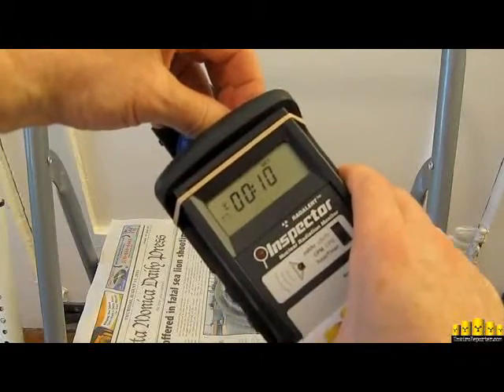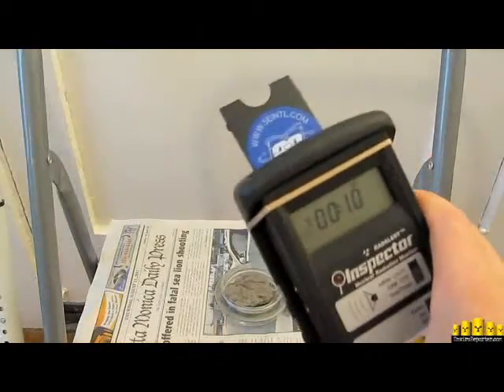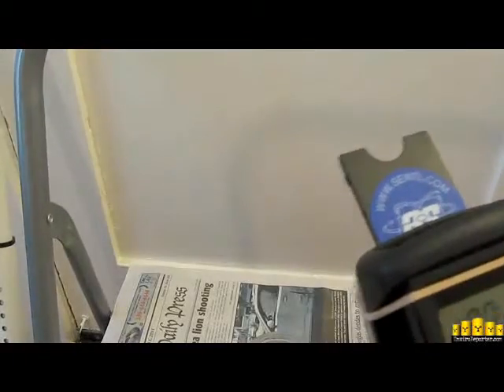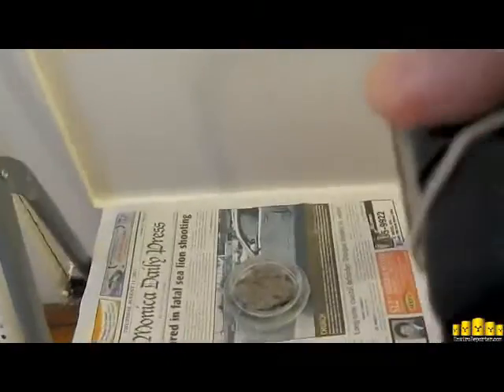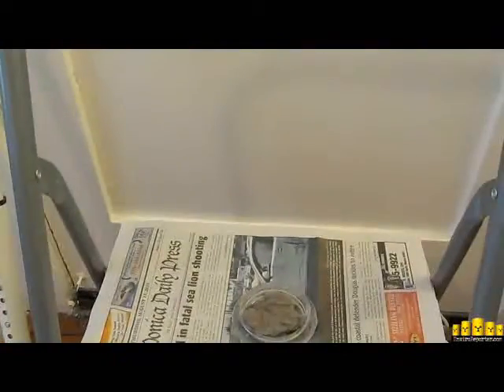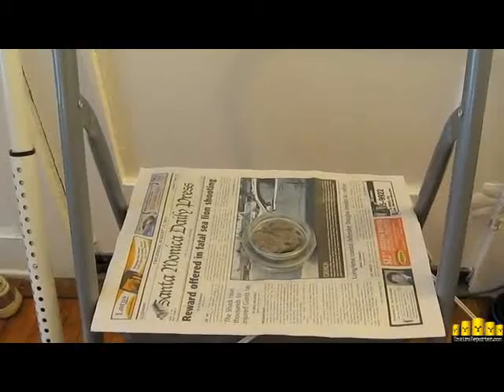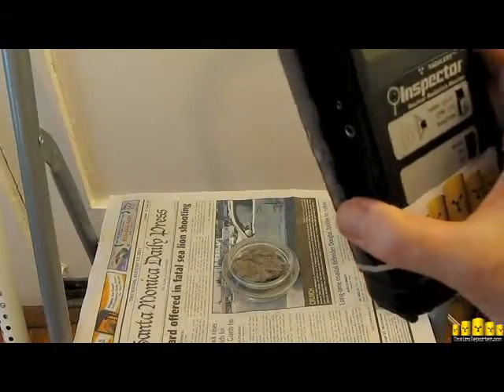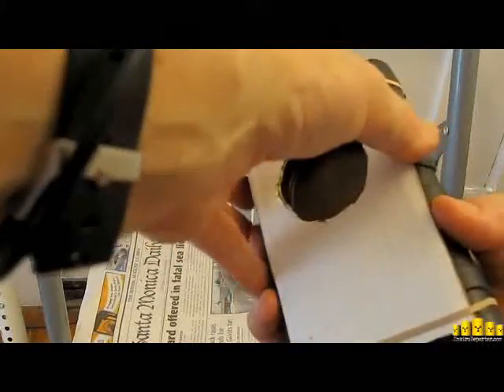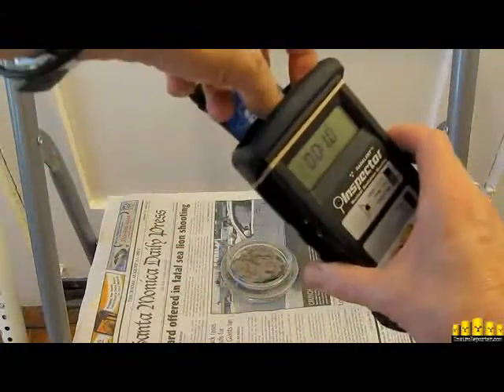Calibrated. We're going to take a 10-minute reading, and we're going to do it right now, and we can hear any overages. I'm actually going to do the rare moving shot, and of course screw it up. I'm going to withdraw that motion. Try this again. And we're going to take an average. And we're going to protect the screen and the detector in there with this Geiger counter condom and the extreme boot. And here we go.